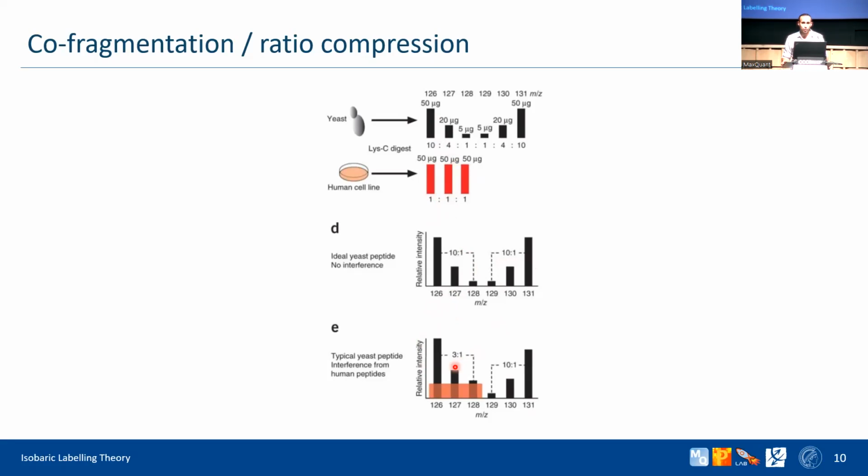Now, maybe it's so bad that you actually don't see a difference then. It can also happen. And this is kind of arbitrary. It's not always compressing, because it can also be the case that it increases the ratio. It's just that the majority of the time, because you expect the majority of the proteins to be at the same 1-to-1 ratio, you will have compression.